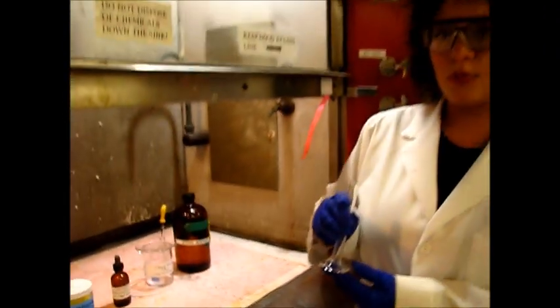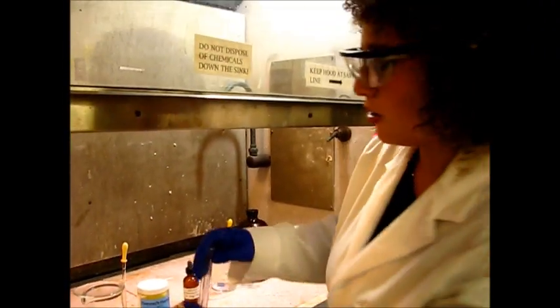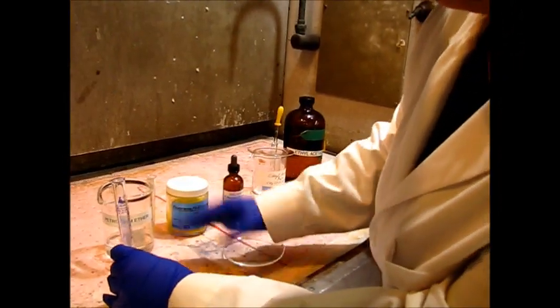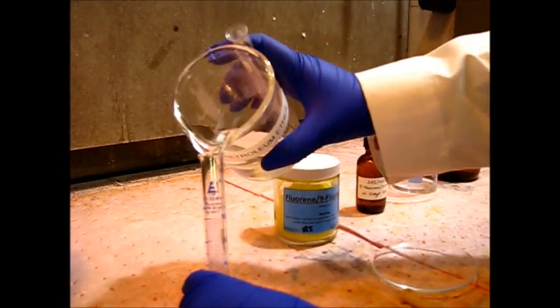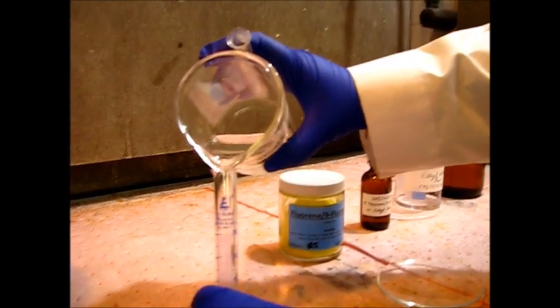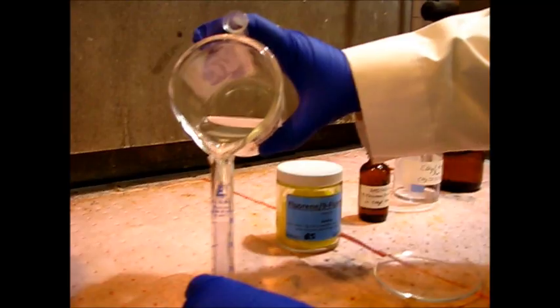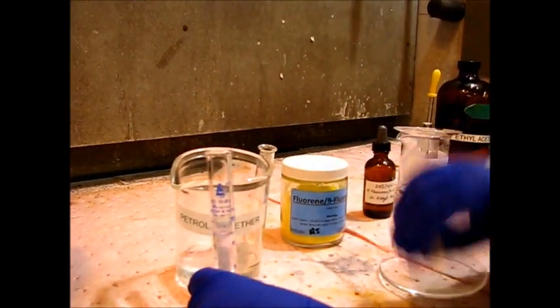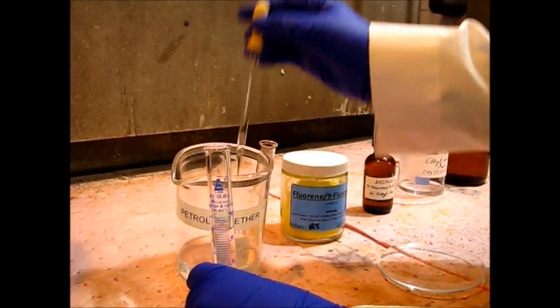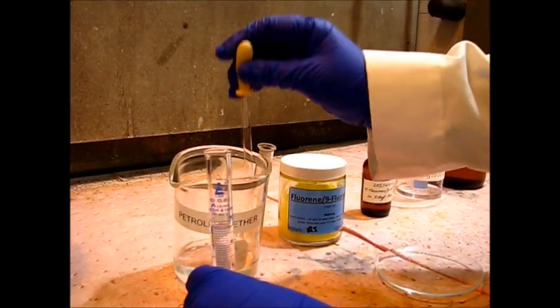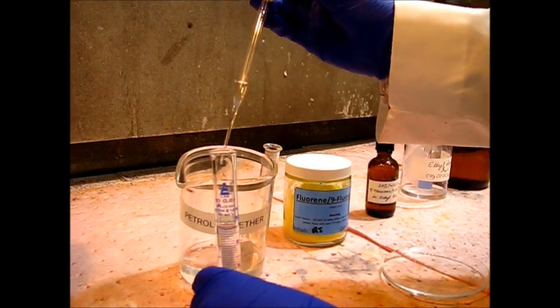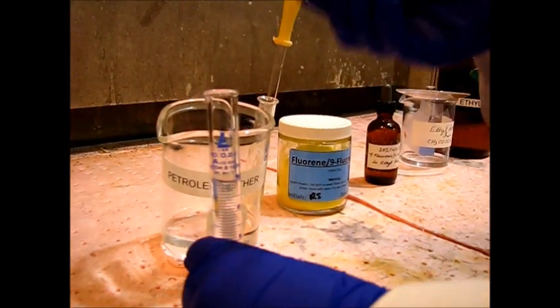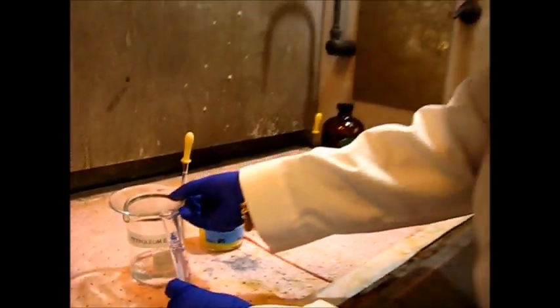We're going to start by pouring 10 mLs of petroleum ether into our 10 mL graduated cylinder. You can start by pouring up until the 9 line or approximately, and then you can use the pipette to accurately measure 10 mLs. Make sure you put the watch glass on top so it doesn't evaporate.